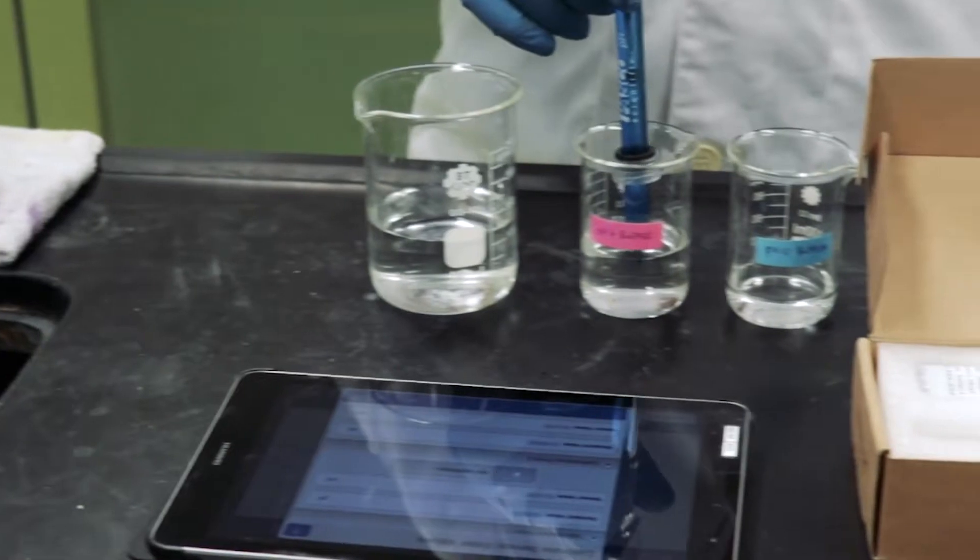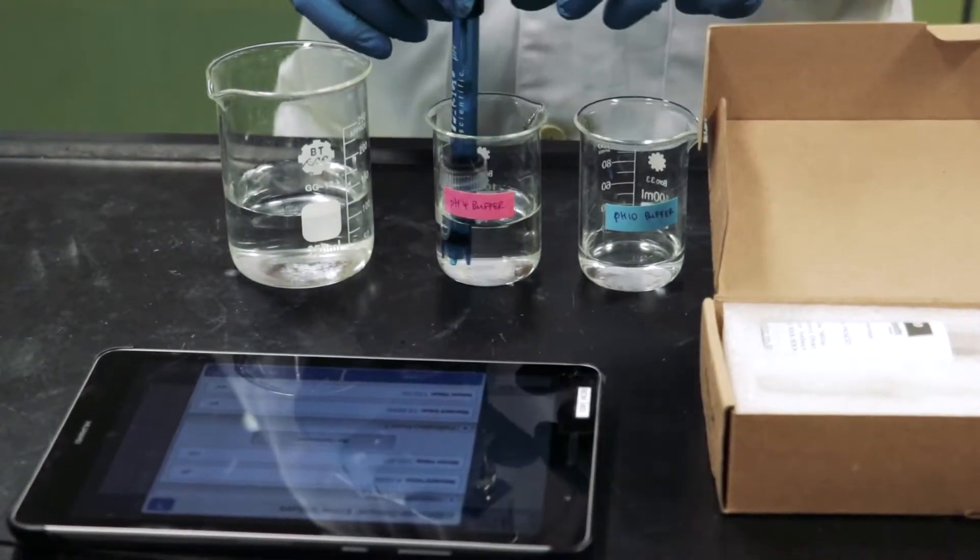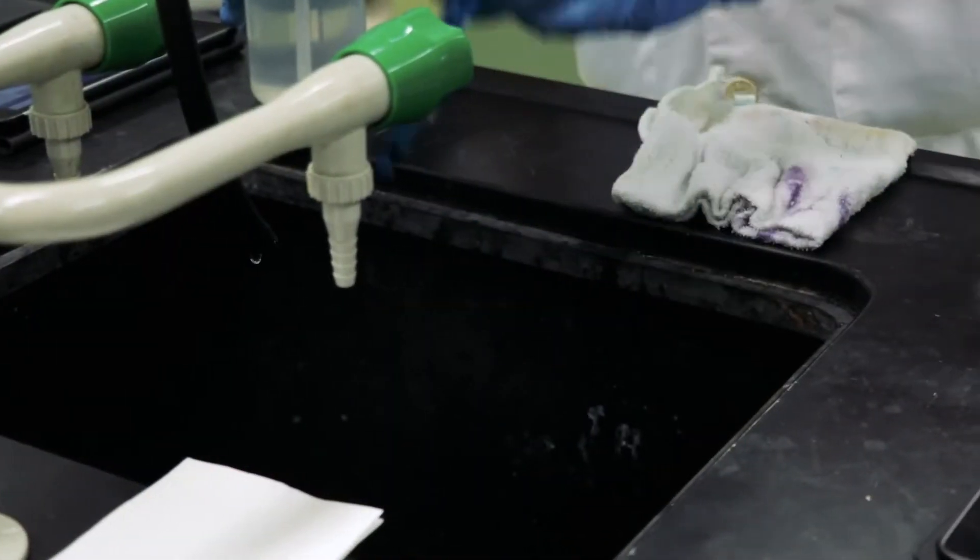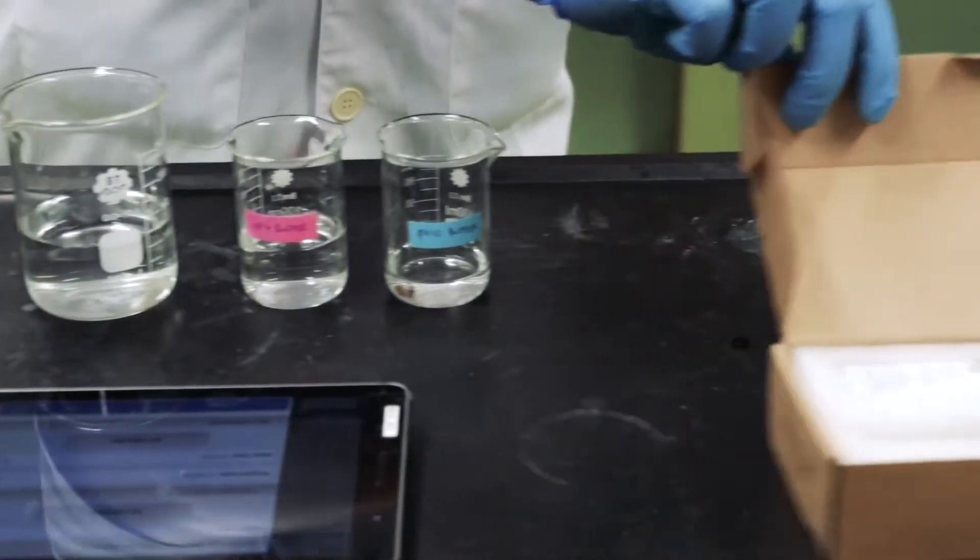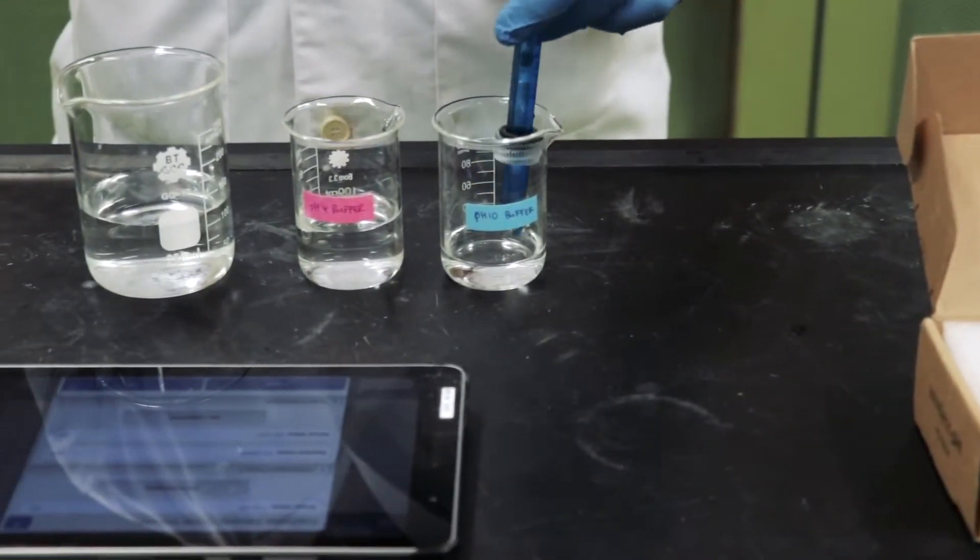For each standard PH value of 4 and 10, immerse the PH Probe in the respective standard solutions for about 30 seconds and press Set Calibration.